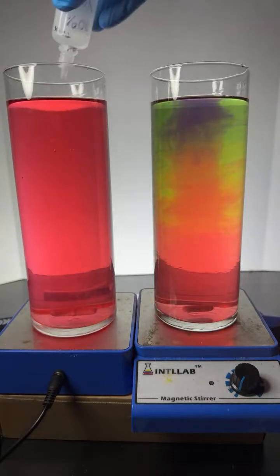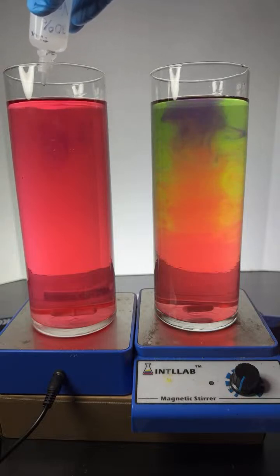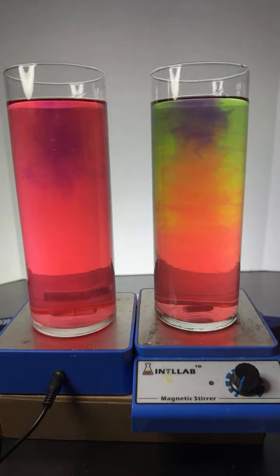In both of these flasks, I have some rainbow indicator added. Are we sure these are different directions? I'm not. I think they are the same.